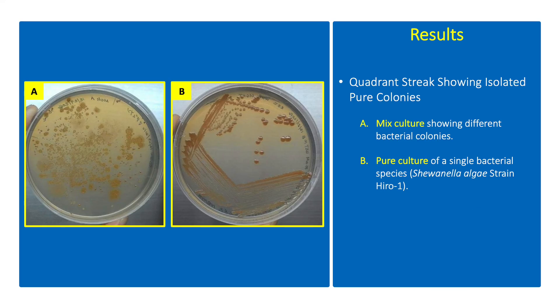This result shows a quadrant streak with visible isolated colonies. The mixed culture is shown where the pure culture of Shewanella algae strain HHO-1 was isolated.